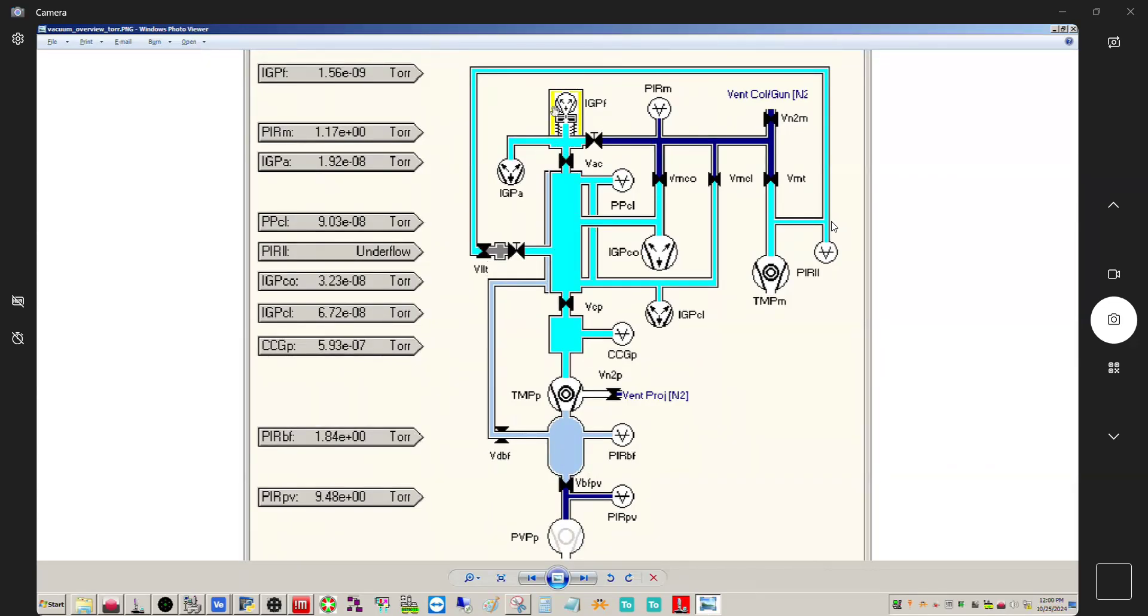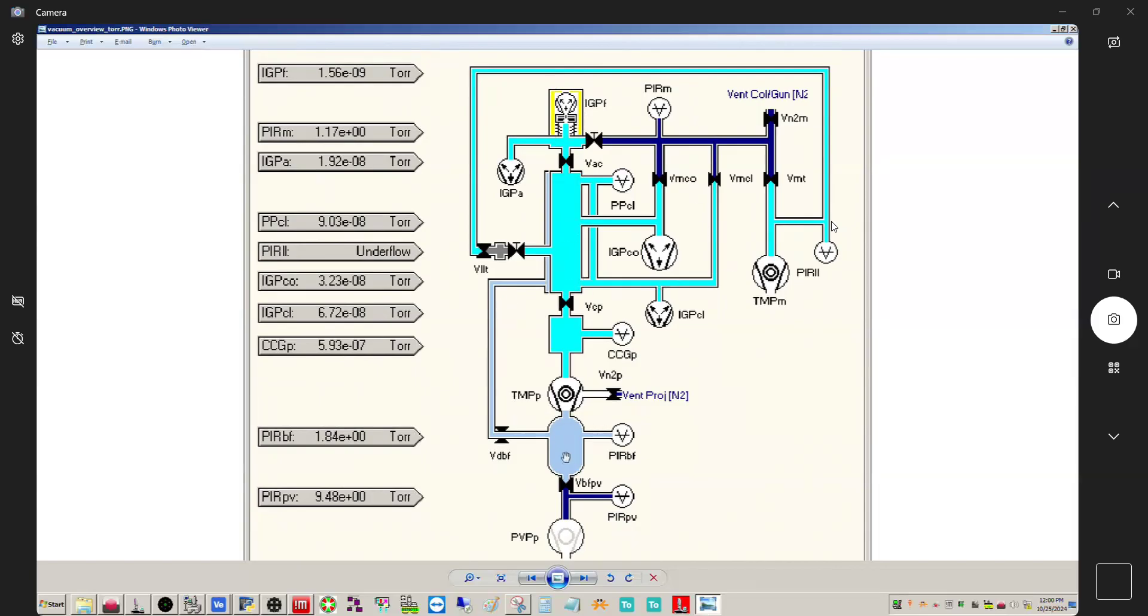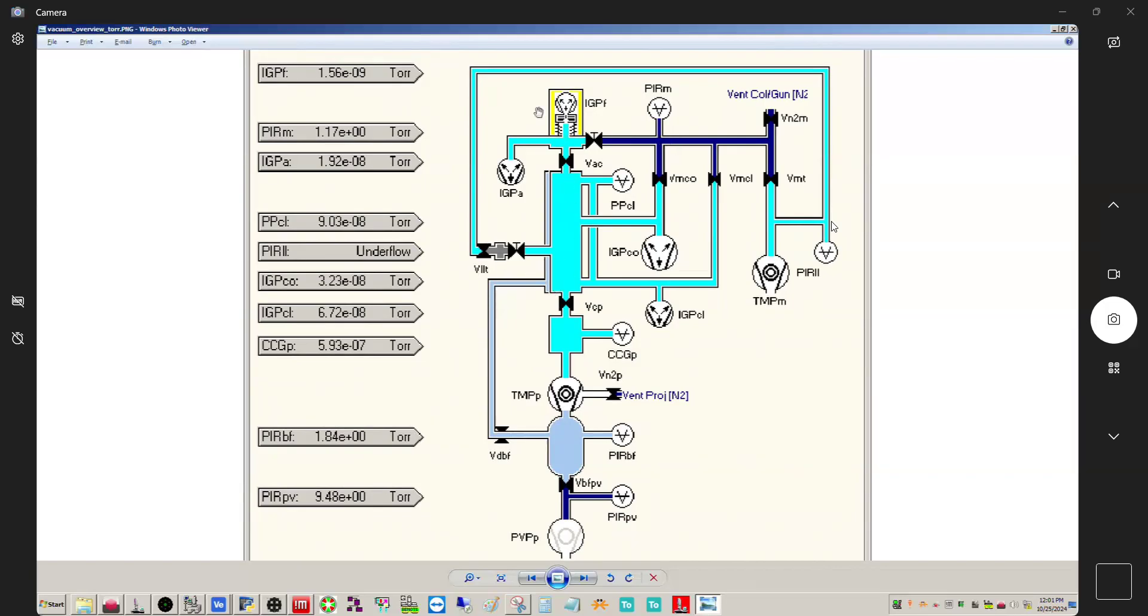So the gun, you'll notice, now the other thing you'll notice here is different colors. So in the FEG area, you notice you don't have like a shade of blue. That's because you have SF6 in here. So they put yellow in there to denote that this is not the same as everything else. Everything else, this is just normal air that you're pumping on, but up here you're on SF6. So as you go from this dark blue to this cyan or teal color, you're getting better in vacuum. And then this is like an intermediary between here. So you actually see the three different colors to kind of show the three different levels of vacuum that the system has. So it's got what are called trip levels. So basically once you get below the trip level for the dark blue, you're going to go to this next lighter blue. And then if you go below that, you're going to go to the teal color.